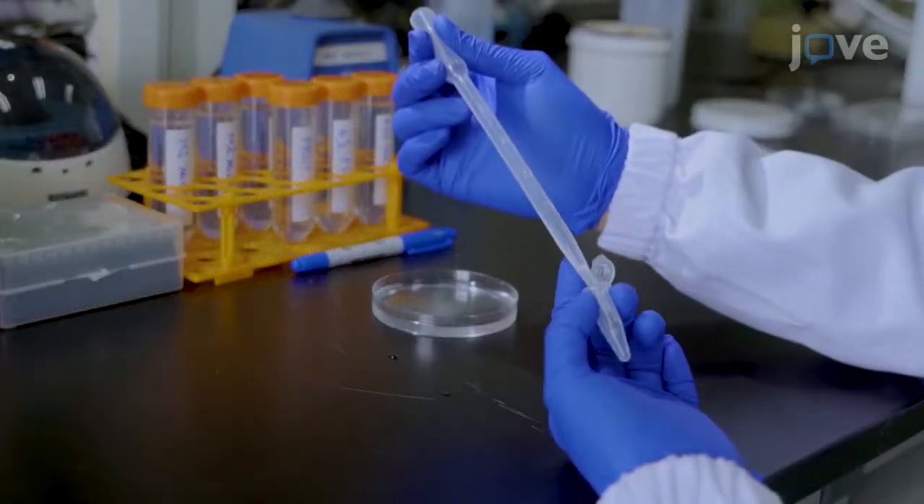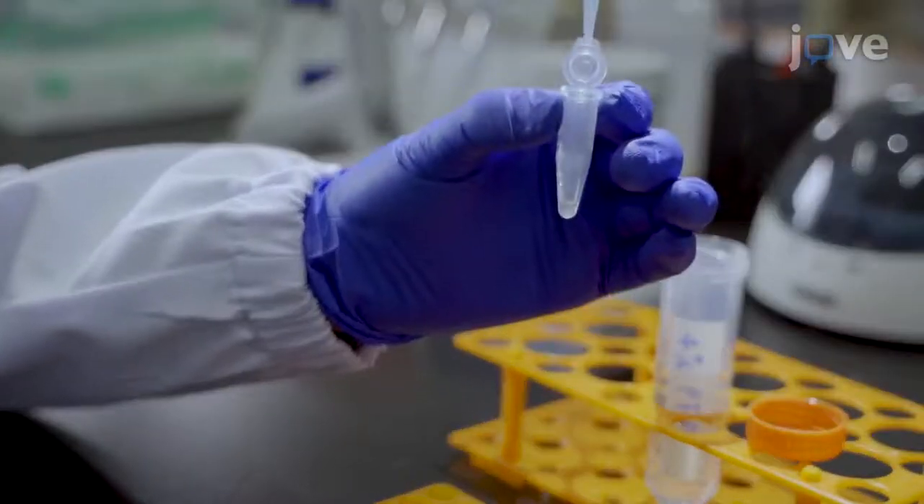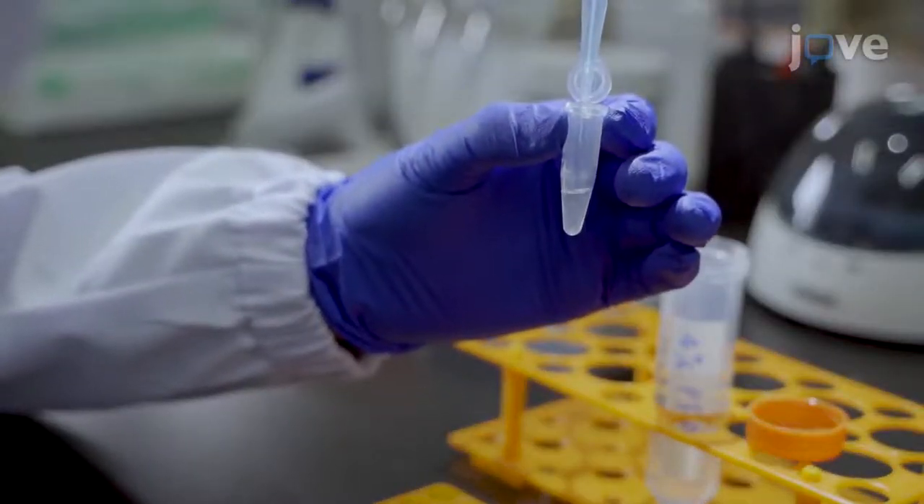Next, use a plastic pipette to transfer 20 to 40 embryos to a 1.5 milliliter tube. Add 1 milliliter of freshly prepared 4% PFA solution at room temperature.